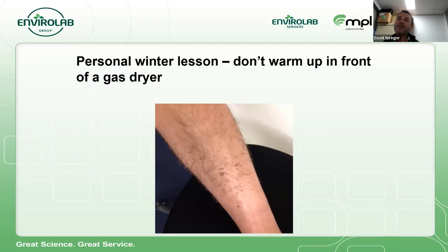I had to hire these big gas blowers, which had to heat up the labs. We had to get the labs heated up to 30 or 40 degrees. So we had these giant gas blowers, and obviously that's very dangerous. We had to have people down there monitoring these gas blowers constantly when they were on. We couldn't leave them alone.